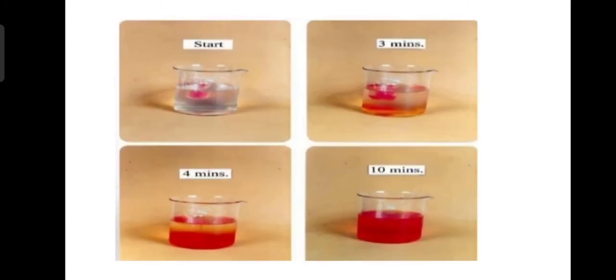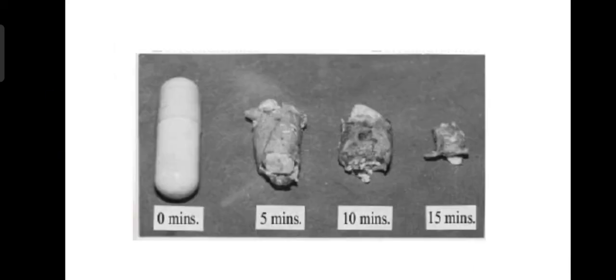Here is the representation of a capsule dissolving from the start to 10 minutes after the capsule is immersed into the dissolution media. In this picture, we can see the disintegration that occurs from 0 minutes to 15 minutes.